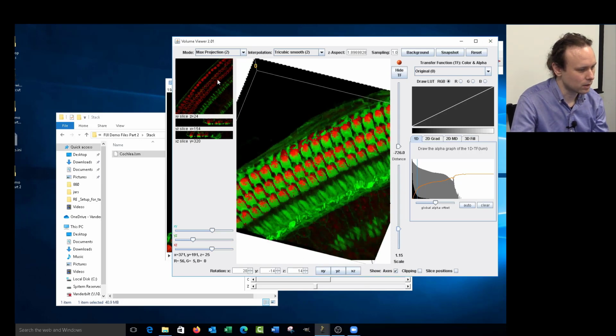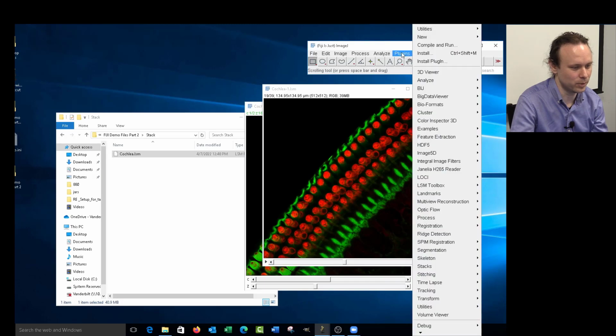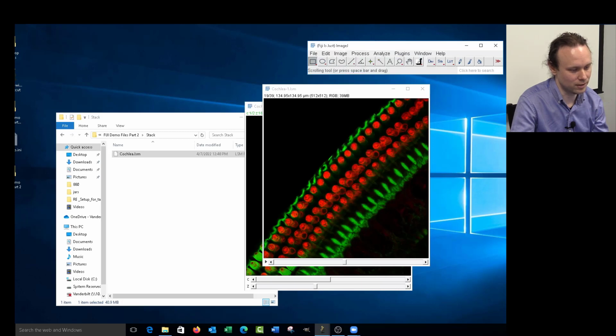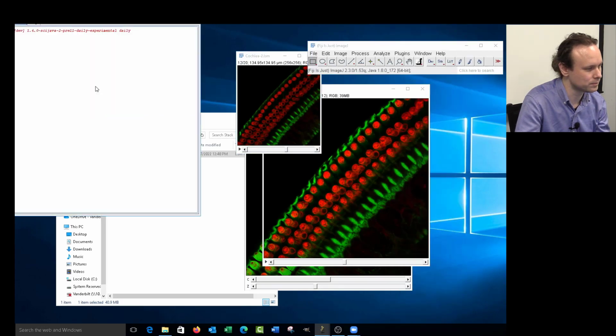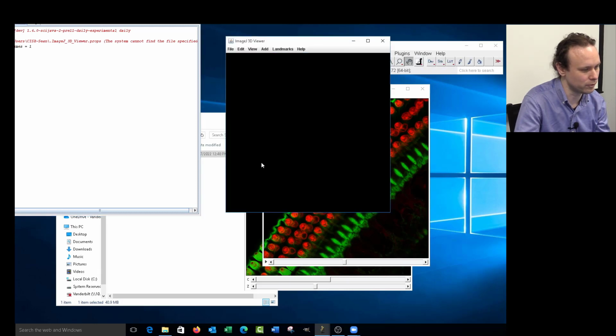All right, I'm going to close this and shrink this file and try to open it again in the 3D viewer, just because there's a cool movie making feature in there. To shrink it, I'm just going to scale this. It's already a pretty small file, but we can shrink it by half and it'll be really small. We'll plug it into 3D viewer, and I'll leave the resampling on as well, so it's binned a little bit further.